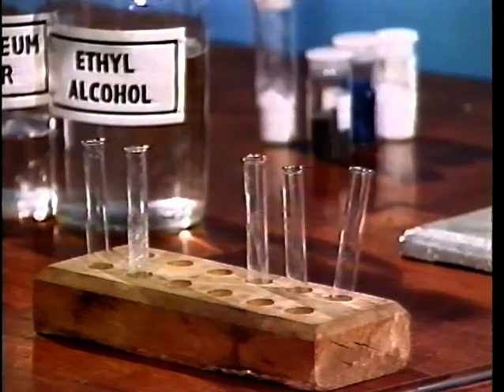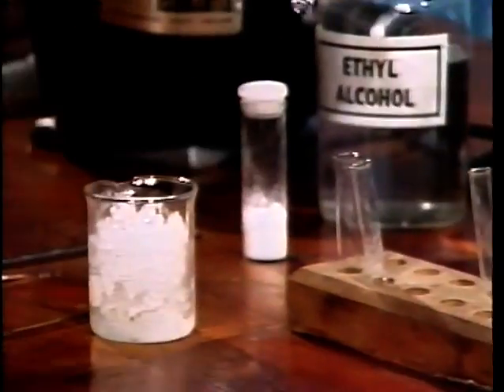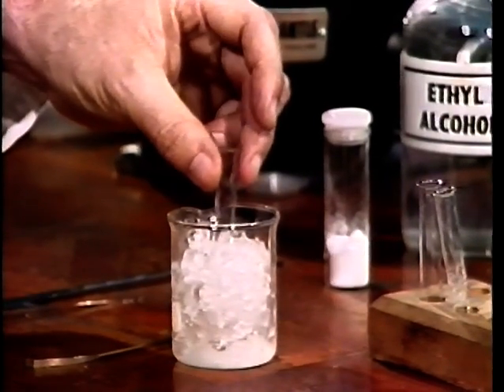Allow the solution to cool to room temperature. Immerse the tube into an ice bath and shake it gently.